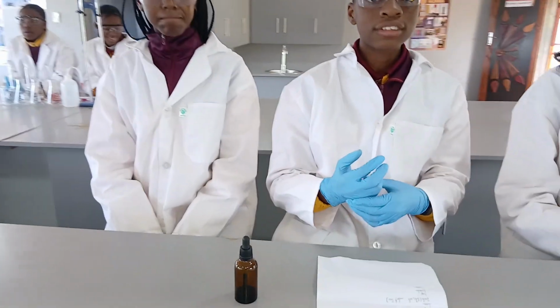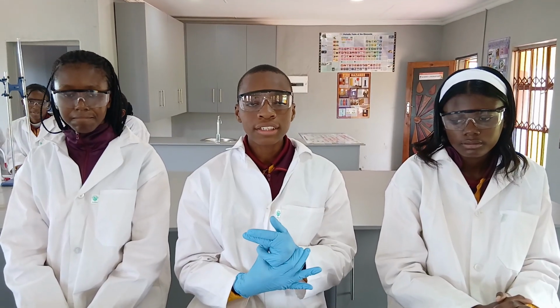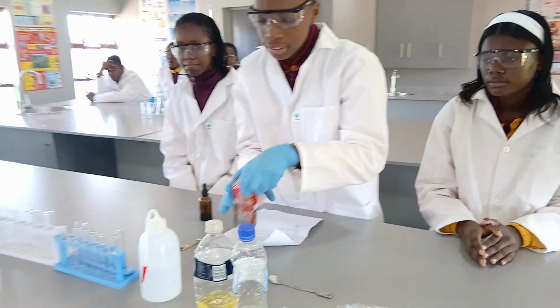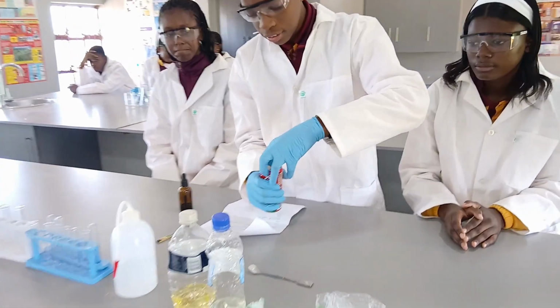It allows me to test if certain household substances are neutral, acids, or bases, and it doesn't have any limitations. Unlike with litmus paper, where sometimes I can only test if a substance is a base or if it's an acid. So this is going to be the first thing we do.